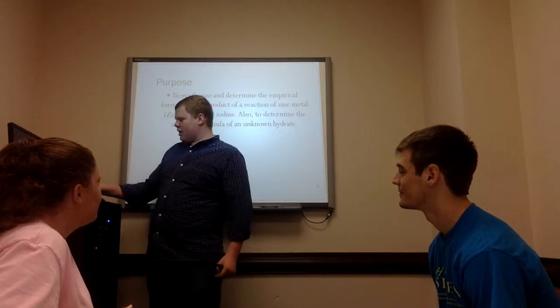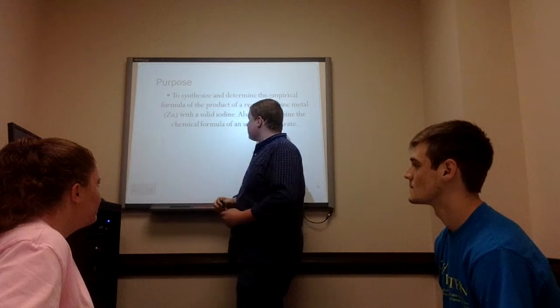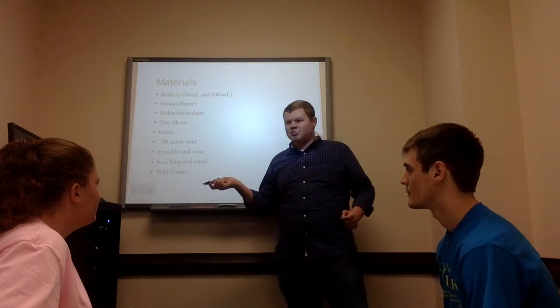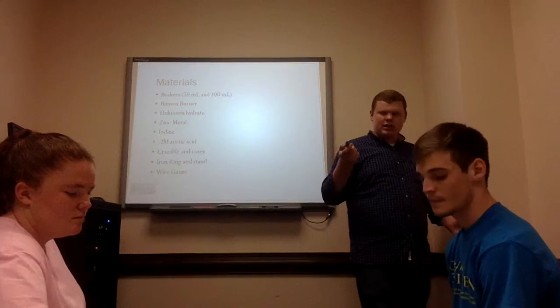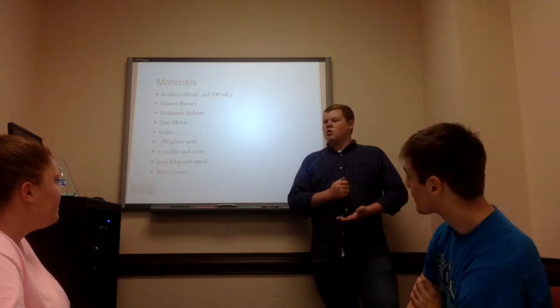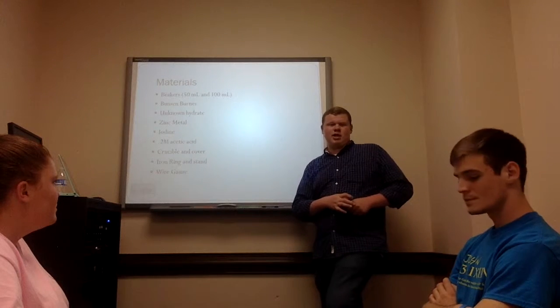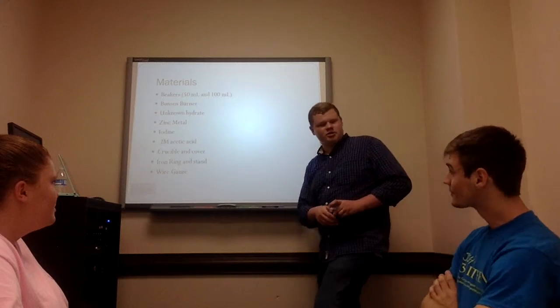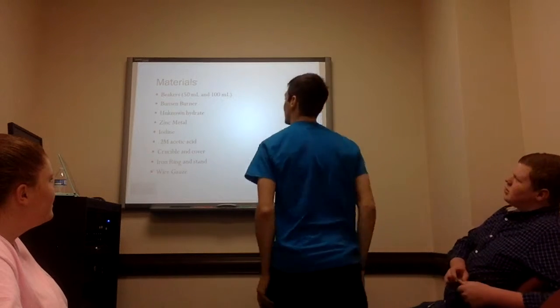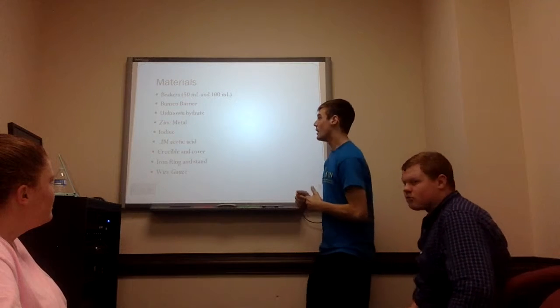And so we're going to go ahead and get started with the materials today. Even though we're not in the lab at this moment, you all have already conducted this experiment. We're discussing it. And so I used Mr. Crossley's excellent list of materials. So could you run through the materials for us up here, Mr. Crossley? Okay. So you have to use a 50 milliliter or 100 milliliter beaker.